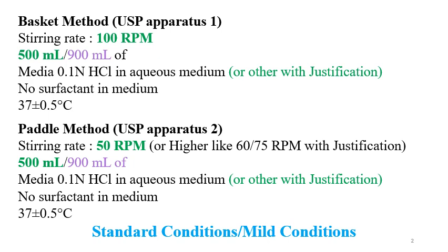For formulations which are immediate release but contain low soluble APIs, these conditions may not be applicable, or these conditions may be changed. But always remember and understand that the dissolution conditions are required to be mild. For example, basket method 100 rpm, 500 ml, and media 0.1 normal HCl without surfactant is the mild condition, or it is the standard condition.